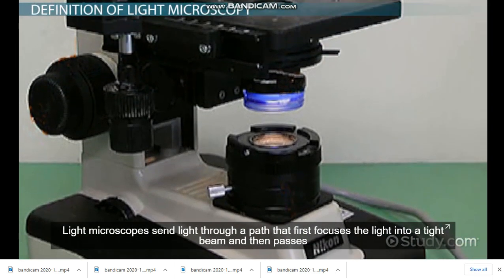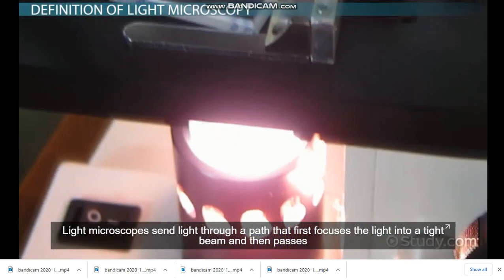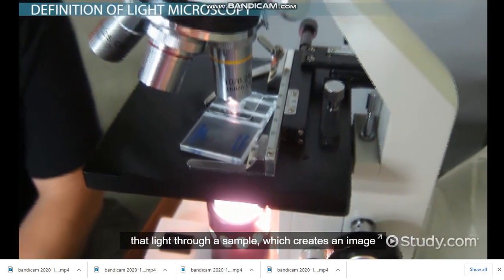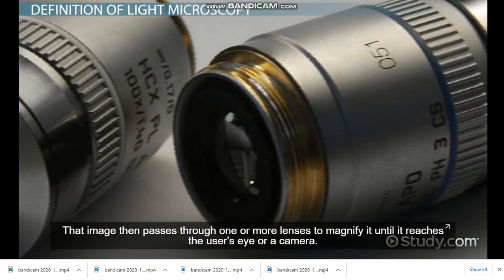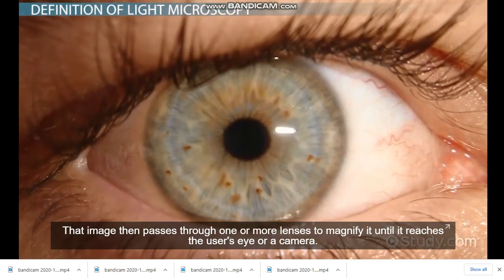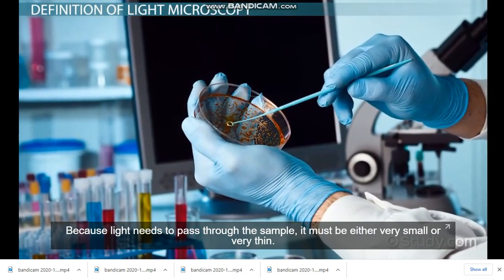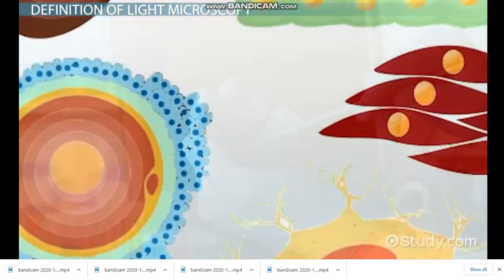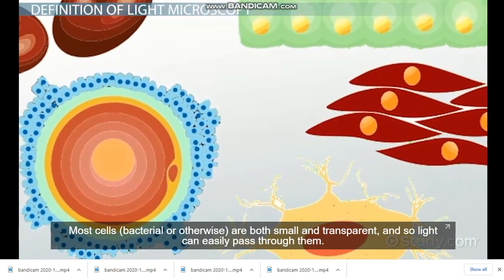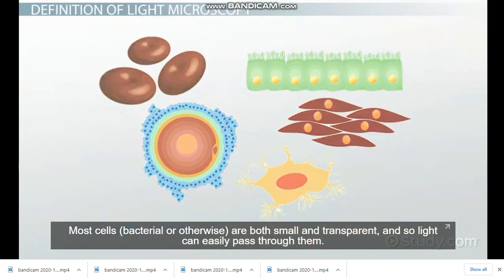Light microscopes send light through a path that first focuses the light into a tight beam and then passes that light through a sample, which creates an image. That image then passes through one or more lenses to magnify it until it reaches the user's eye or a camera. Because light needs to pass through the sample, it must be either very small or very thin. Most cells, bacterial or otherwise, are both small and transparent, and so light can easily pass through them.